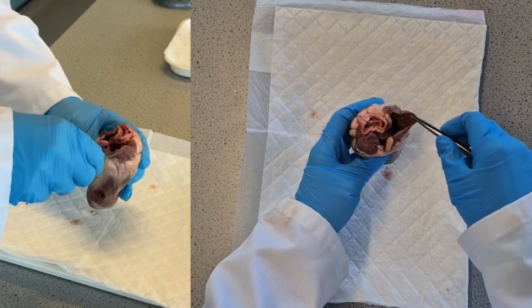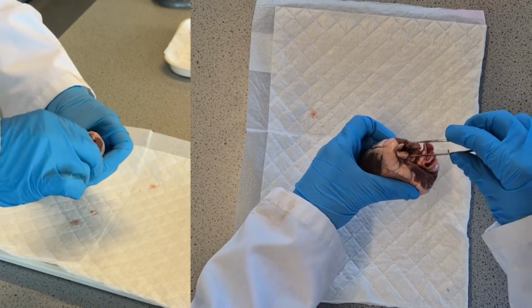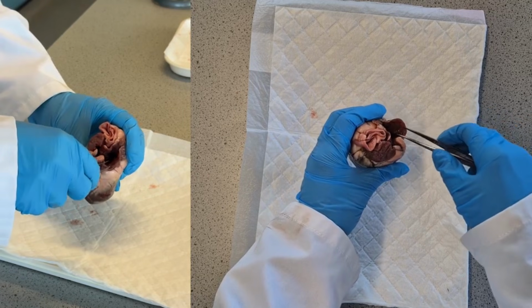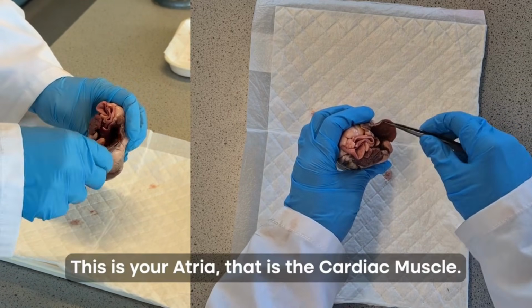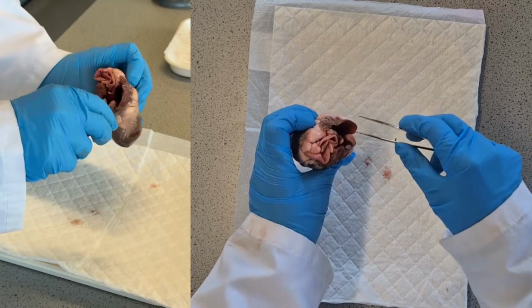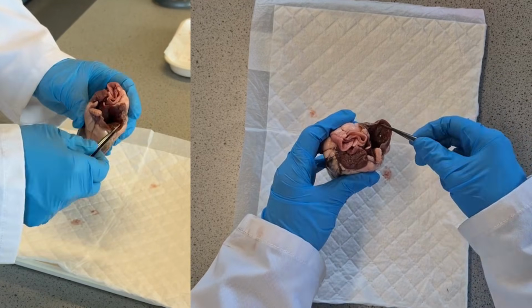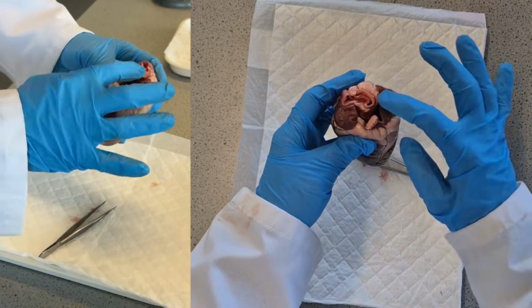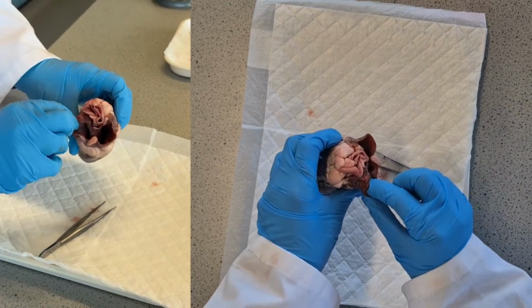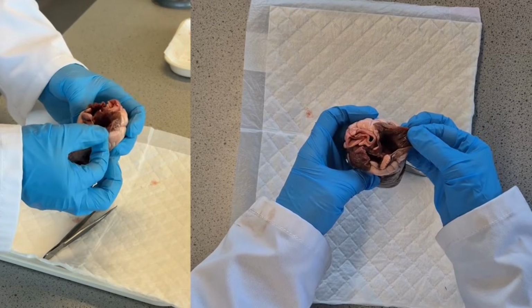After that, we can now see here are the atria, and in mine, they've already been cut into. So the key things that I'd be pointing out to the students here is, this is your atria, that is the cardiac muscle. You can see just how thin the cardiac muscle is in the atrial wall. And that's because they don't contract with much force, because they only have to pump the blood down into the ventricles, which is not a far distance. Once they've identified those, they can then take photos of that as well.